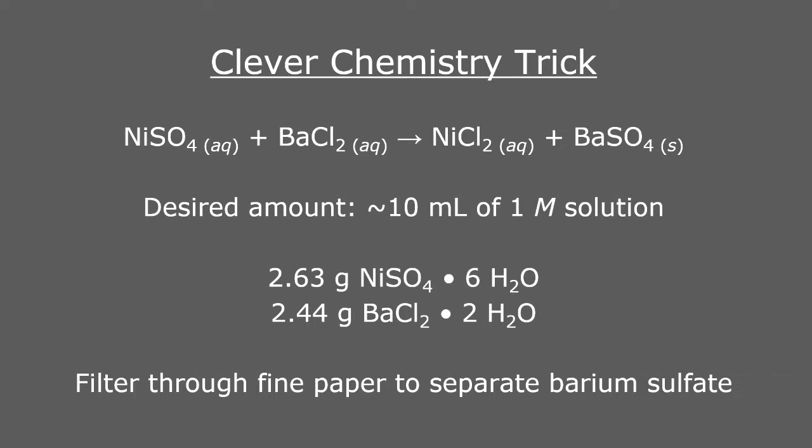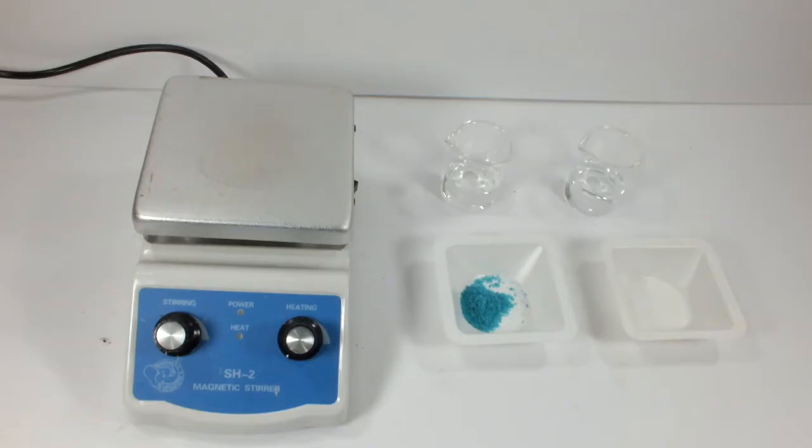So if I were to calculate a perfectly stoichiometric ratio, I should have an almost quantitative yield of barium sulfate precipitate and a usable solution of nickel chloride.